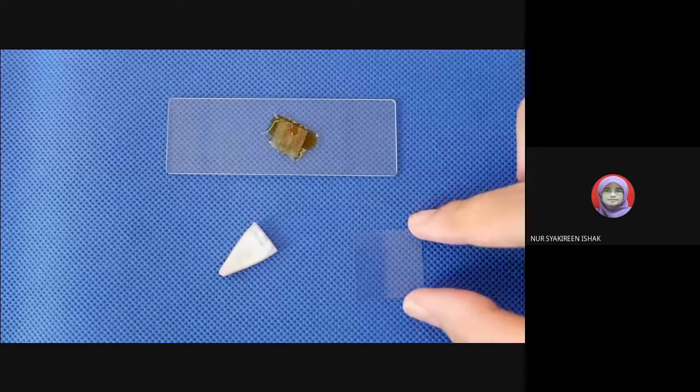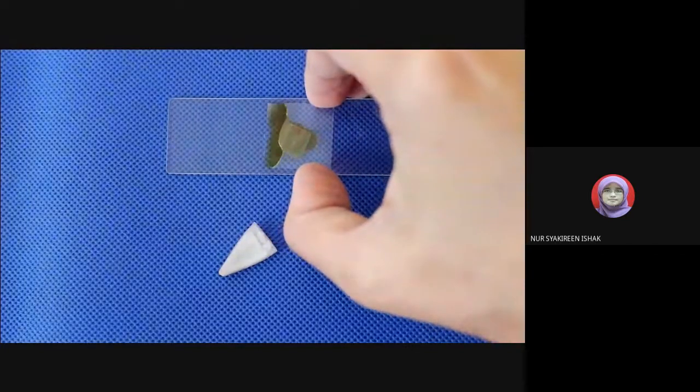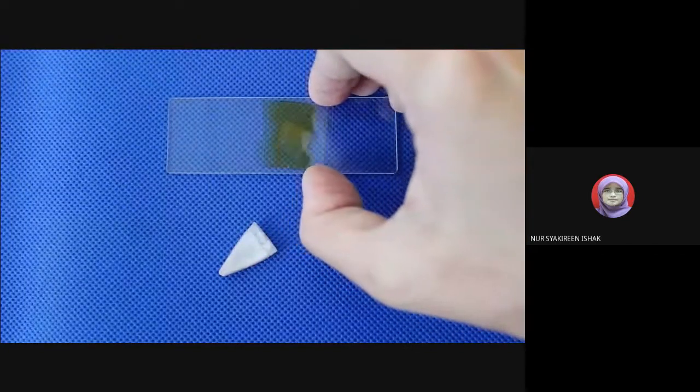Place one edge of the cover slip to one side of the stain and slowly lower the cover slip. If you need to remove excess stain, touch the edge of the slip with a paper towel.